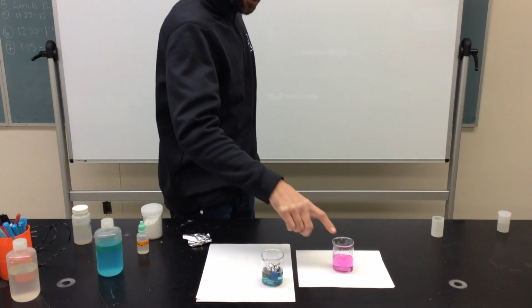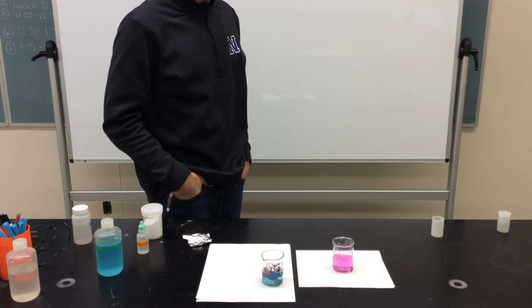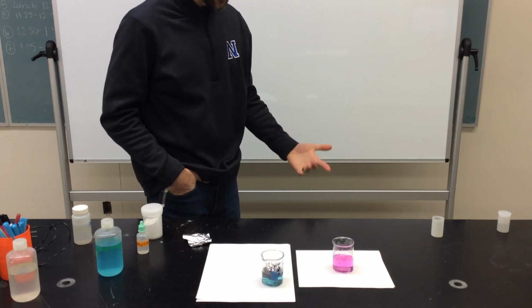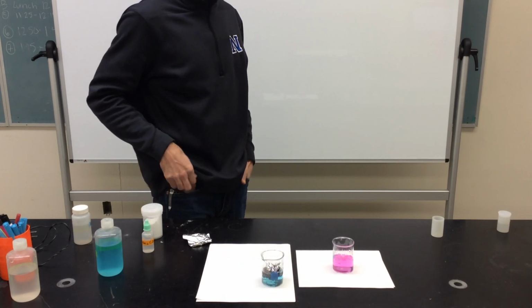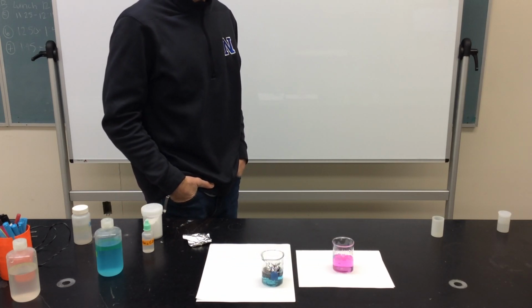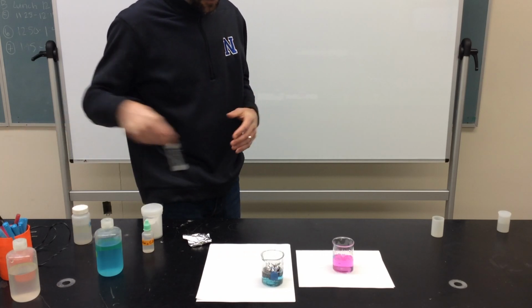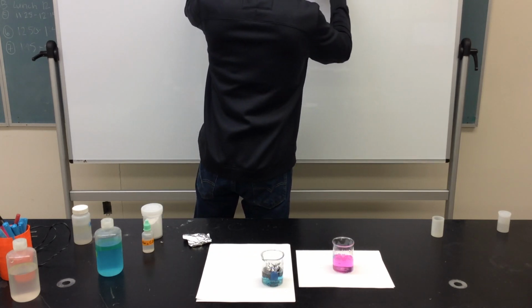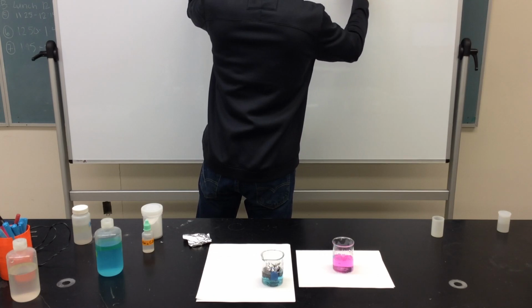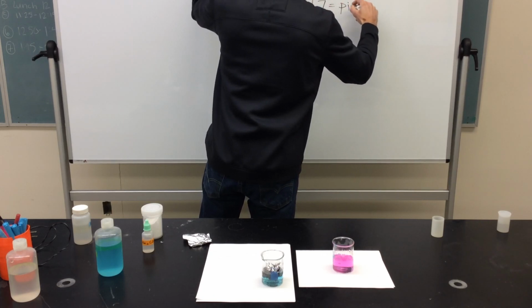I want to take a second and talk about what's happening here in the beaker, though. This is an acid-base reaction. Hydrochloric acid is an acid, and sodium carbonate is a base. There was one other thing in there that I didn't tell you about, though. That was an indicator called phenolphthalein. When you are using phenolphthalein, if the pH is below 7, it's going to be clear. If the pH goes above 7, it turns pink.